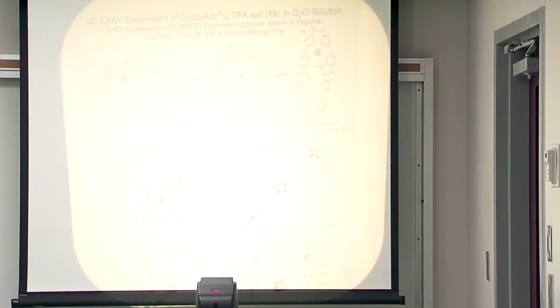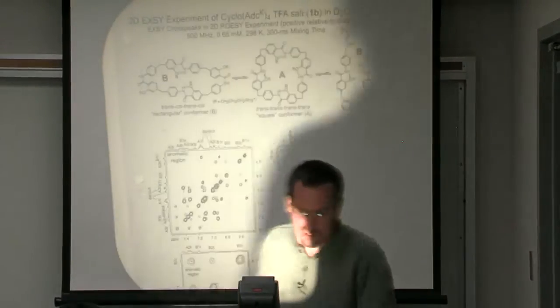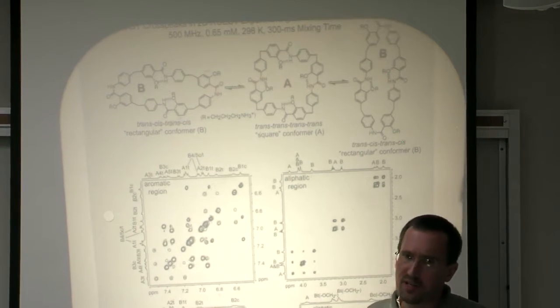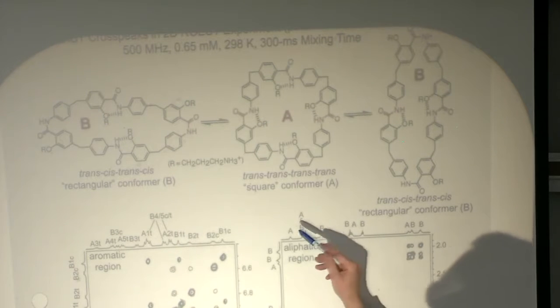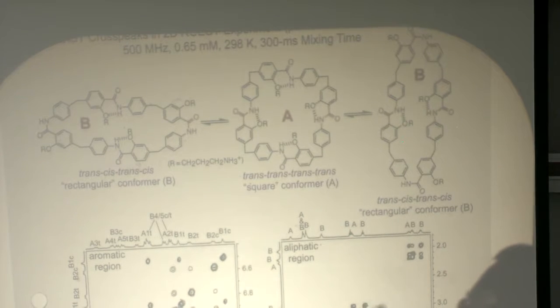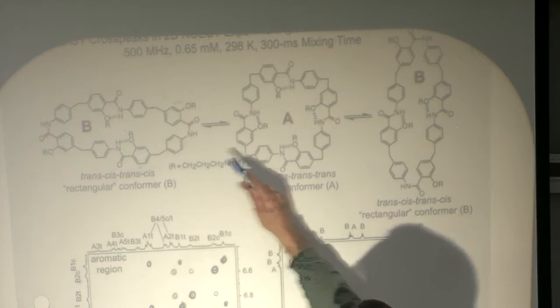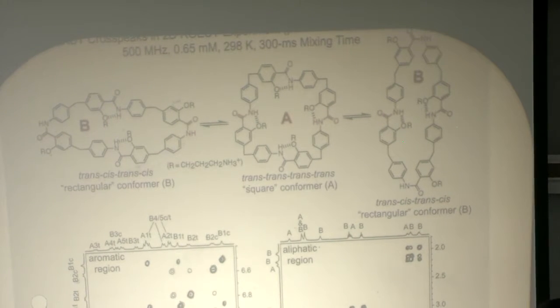So one of these, when you get multiple conformers, it is really a nightmare, because your spectra get so complicated. So this is a macrocycle that one of my students prepared. The molecule has 4-fold symmetry, but the problem is you have a conformer in which the molecule has 2-fold symmetry. And there are 2 varieties, two identical degenerate versions of that conformer. So here you see 1 type of resonance. Here you see 2 types of resonances, but then each of those 2 can swap around. And so my student Sang was trying to establish that these were indeed interconverting conformers.